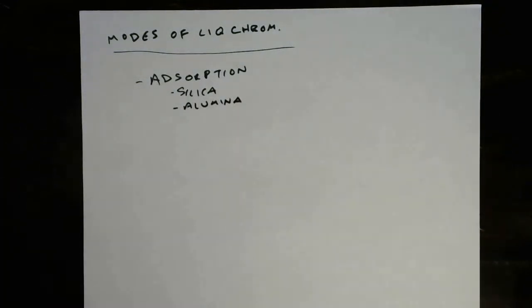Basically the take-home story here was that these surfaces are essentially too high energy. There are too many functional groups, too many intermolecular forces that allow molecules to bind to the surface, and so retention is essentially too strong. You'll remember when we were talking about retention factors, we said basically chromatography ends at a retention factor of 15.